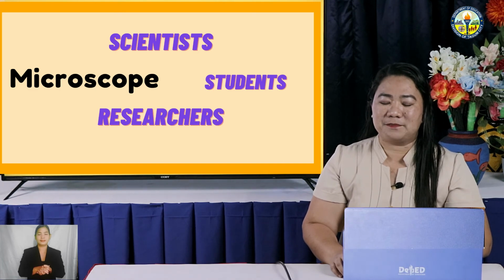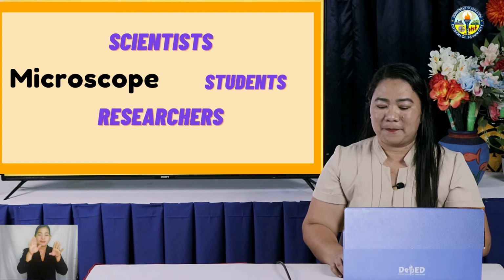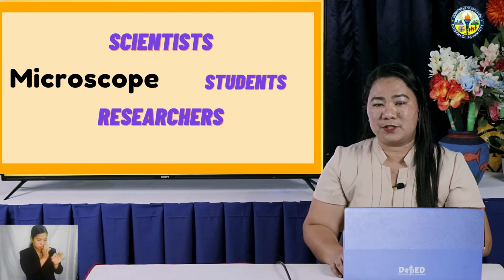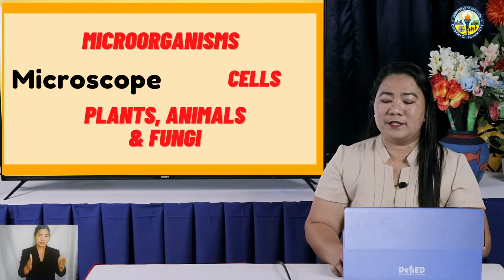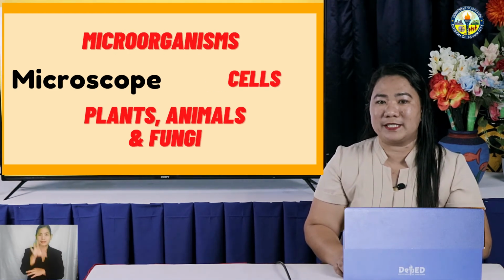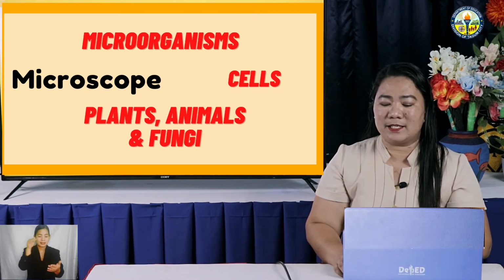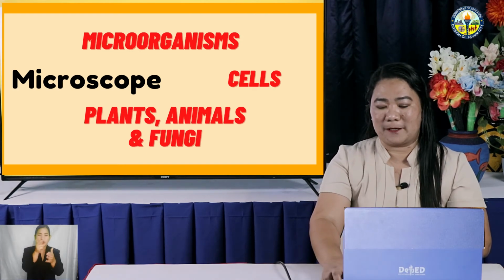Always remember that microscopes have opened many doors in science. By using microscope, scientists, researchers, and students were able to discover the existence of microorganisms, study the structure of cells, and see the smallest parts of plants, animals, and fungi.